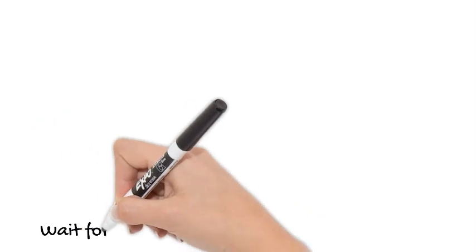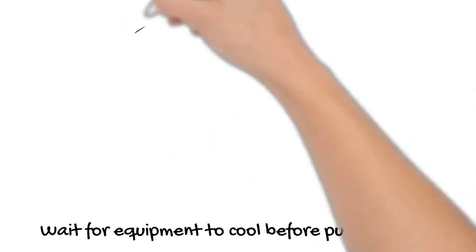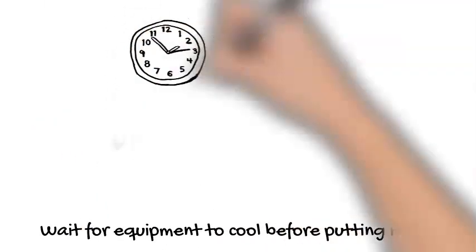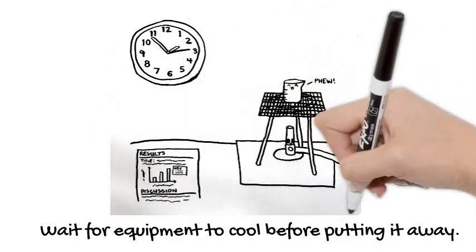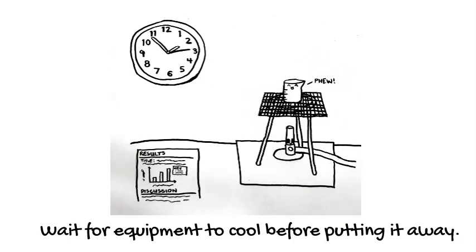Before putting your equipment away, make sure it is cooled down enough for you to safely touch and put away. While you wait for things to cool down, it's a great time to check your results are complete and start writing your discussion section.